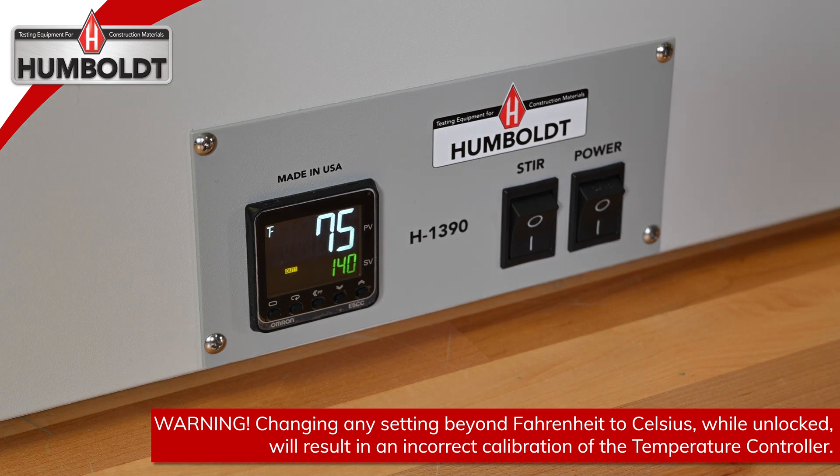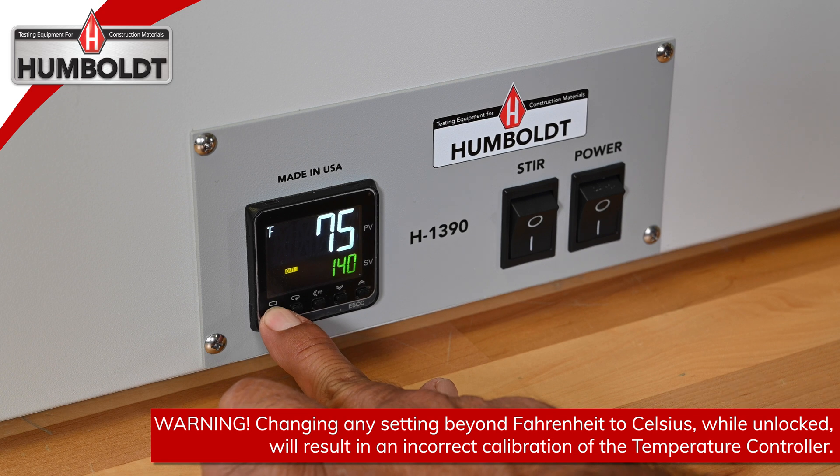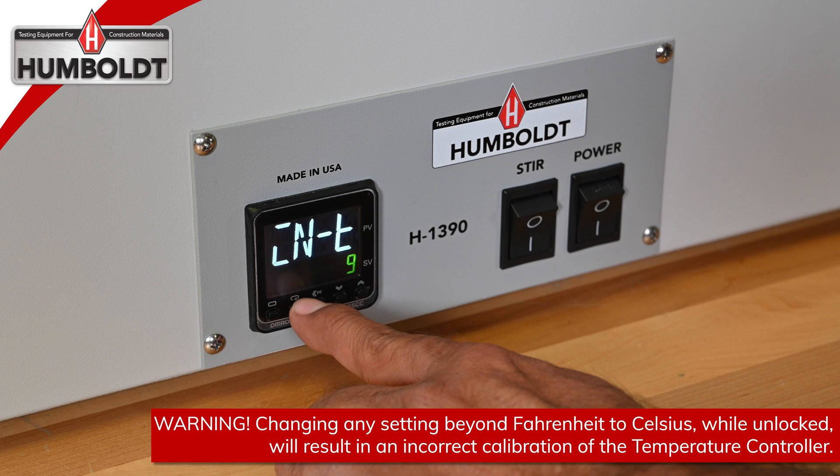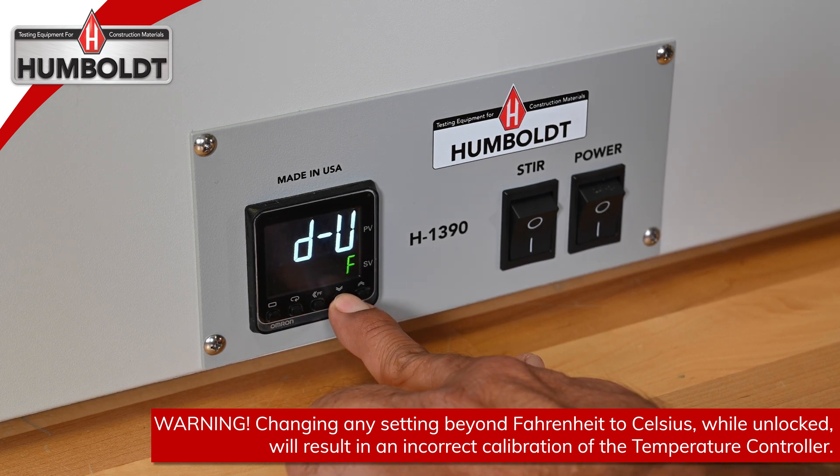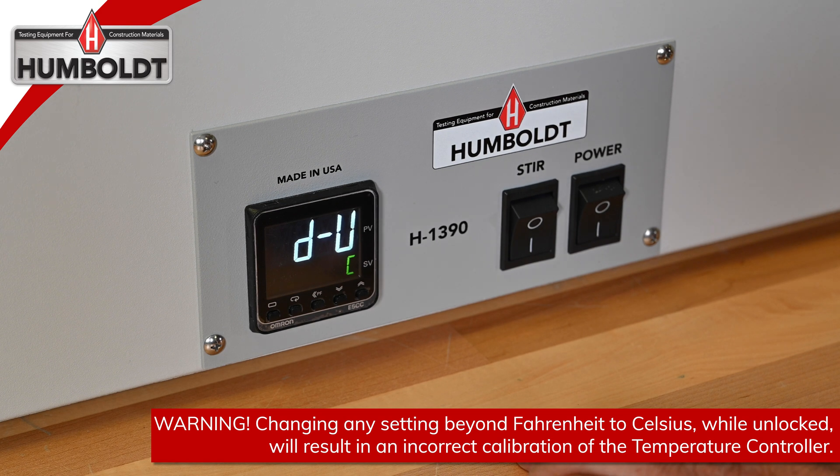The controller is ready to switch between Fahrenheit and Celsius. Hold the first button on the left for 4 seconds. Once the screen changes, press the second button from the left. You will now see the D-U, F or C screen. Press the down or up arrow to change F to C or C to F.